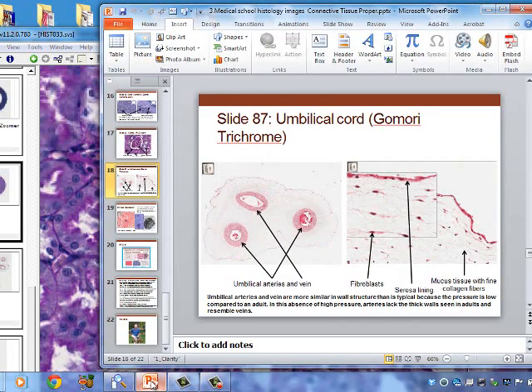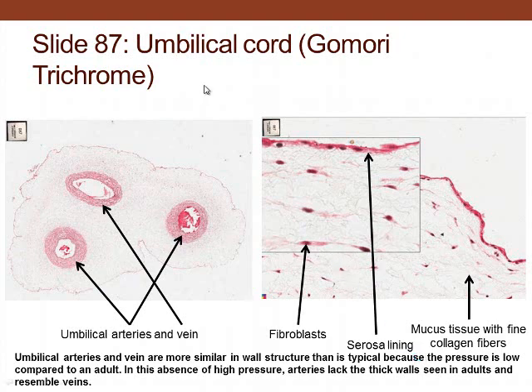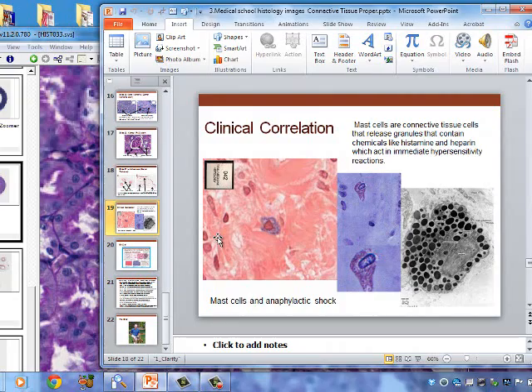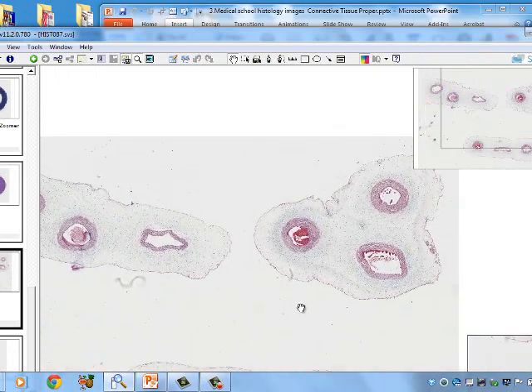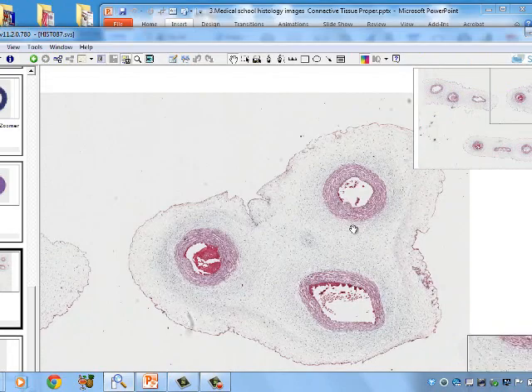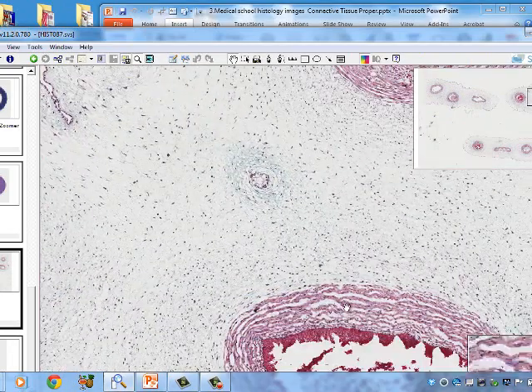Another type of connective tissue is found in the umbilical cord — mucous connective tissue. It has very fine fibers and fibroblasts to support the cord. The umbilical cord contains two arteries and a vein, which we'll see in the next slide.